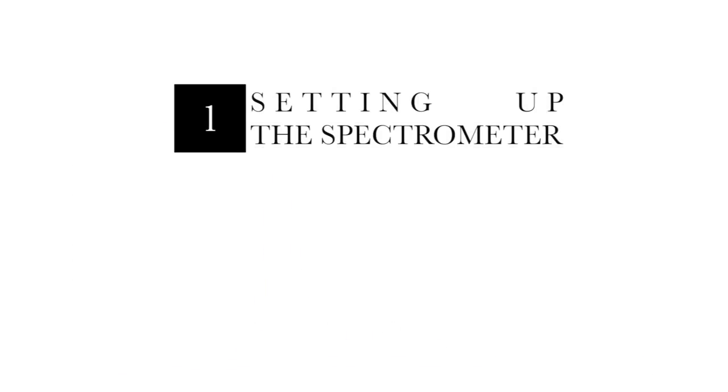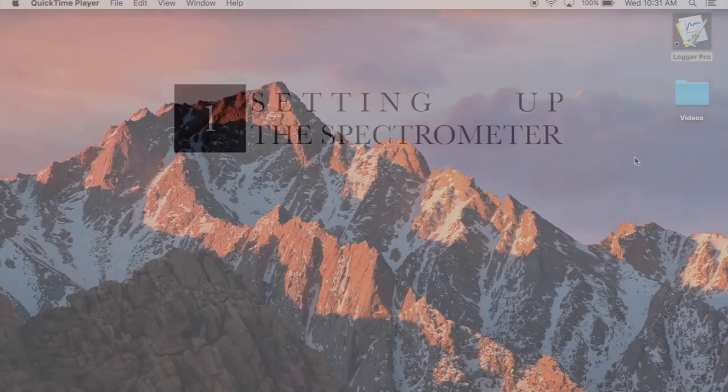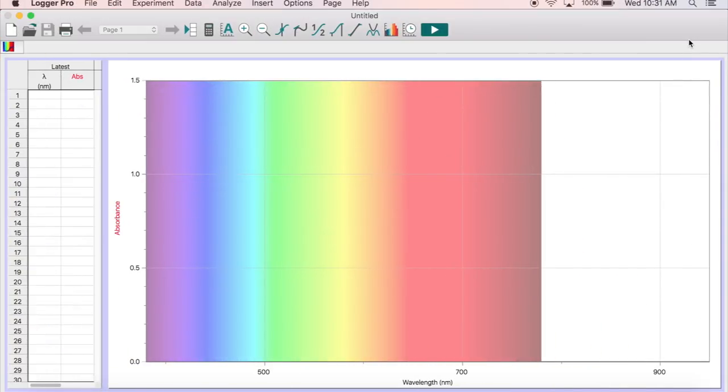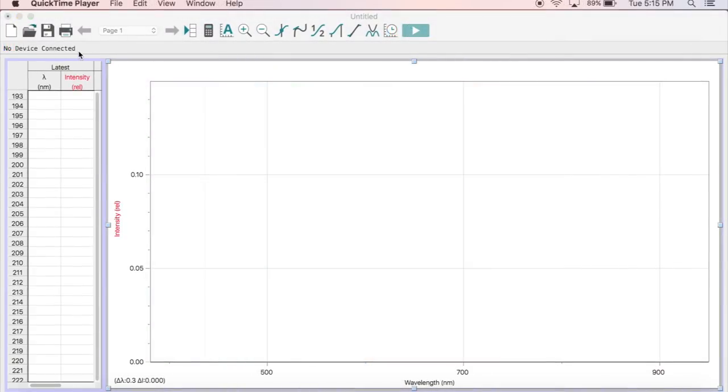To begin using the spectrometer for emission spectroscopy, you must first change a few settings. When you initially plug in the spectrometer, you should see a rainbow background on the screen. If you do not see this, it means the spectrometer is not communicating properly. Check the USB connection and relaunch LoggerPro if necessary.